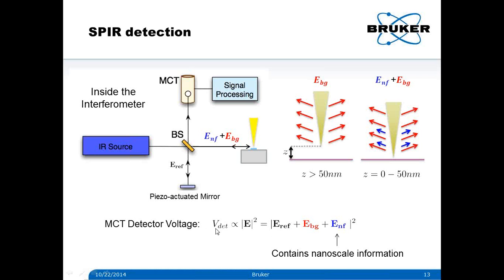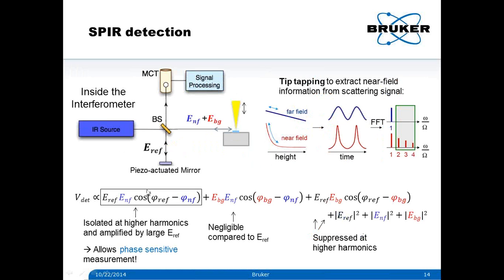And if we calculate this term here, we end up with this long term here, which looks scary at the beginning, because we are also only interested in the near field here in the first term. We want to find a way how to get rid of the other terms, and it's pretty simple to do so. And what we use is shown here on the right-hand upper side.